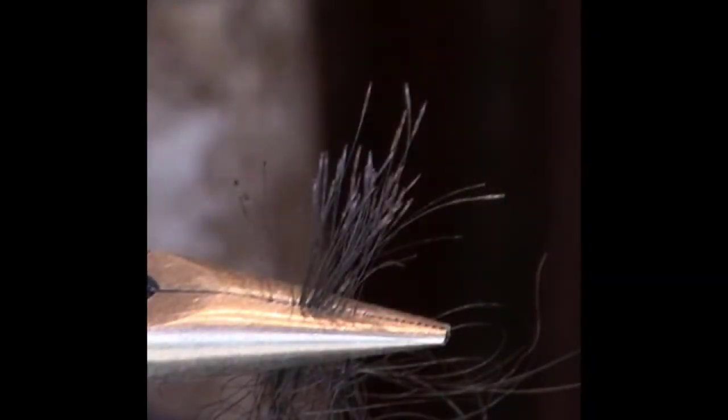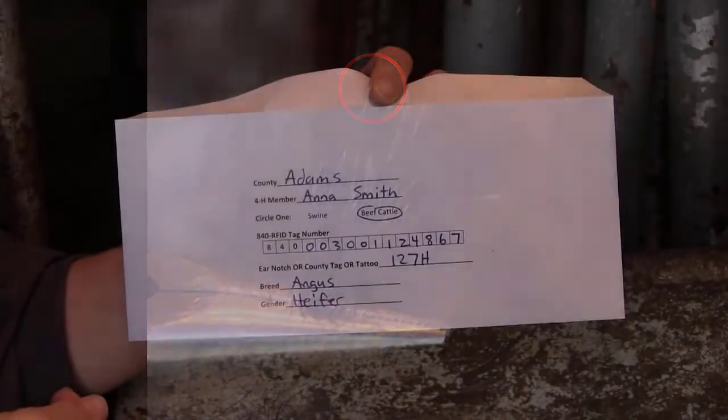Do not cut the hair from the animal, as the roots must be present for DNA analysis. Pull enough hair such that your sample is about the size of a pencil, which is approximately 30 hairs. Repeat the pulling process if necessary until you have enough hair with roots. Visually inspect the hairs to ensure the roots are attached — these appear as clear or white tips on the ends of the hair. If the roots are not present, discard the sample and start over.